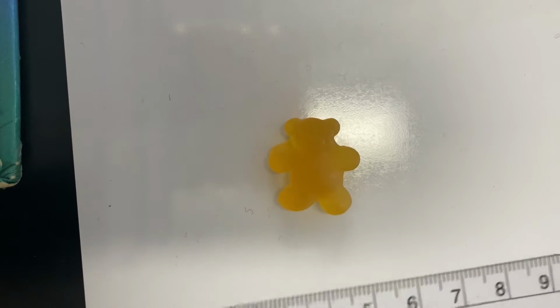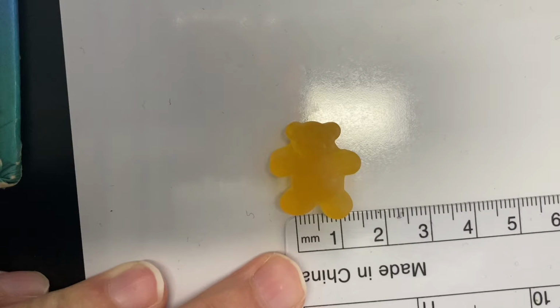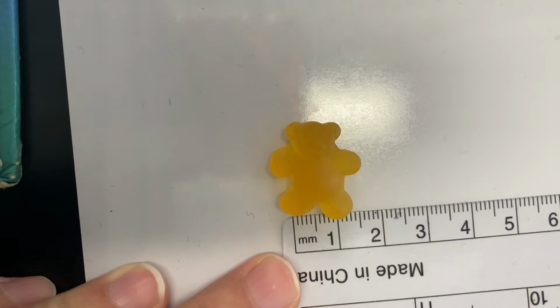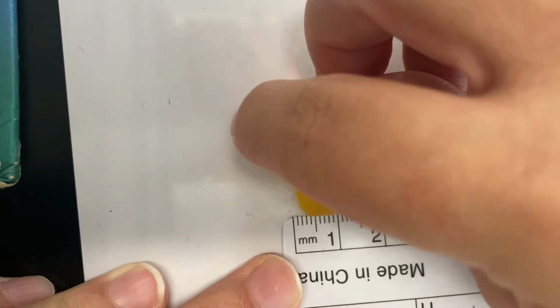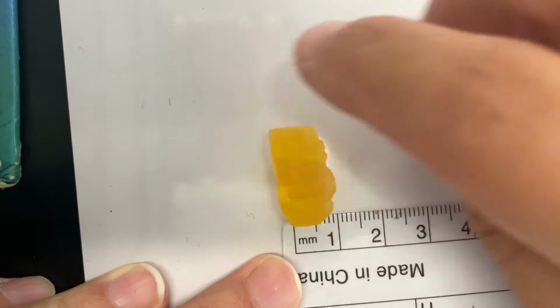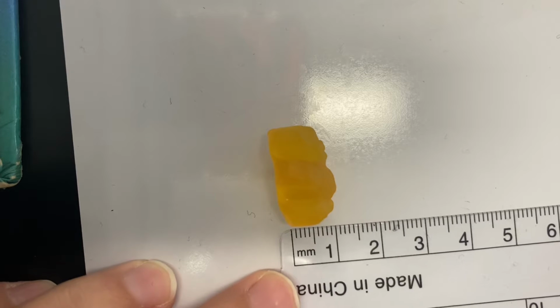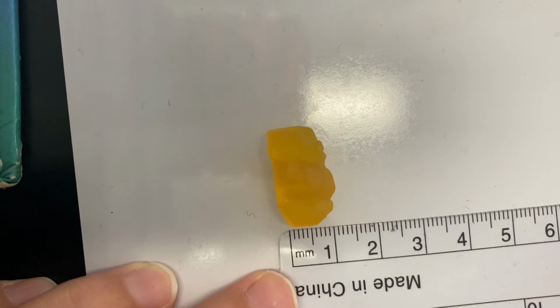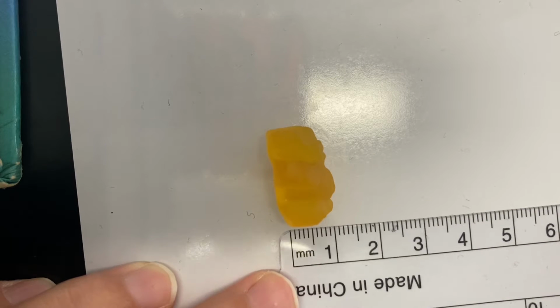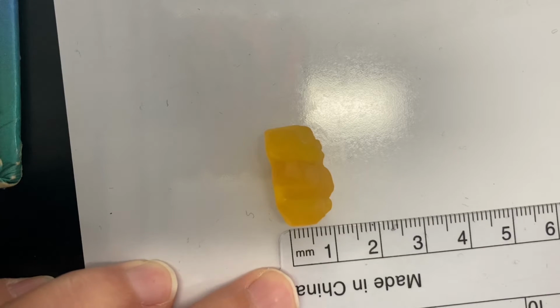Now we're going to measure the width. Go ahead and pause the video and see if you can determine it for yourself. But the width changes throughout the gummy bear, so let's just measure it at its widest. So probably 1 centimeter would be a good guess.